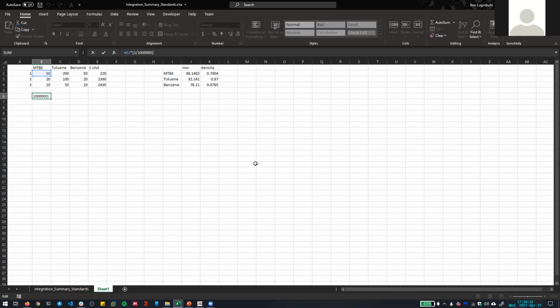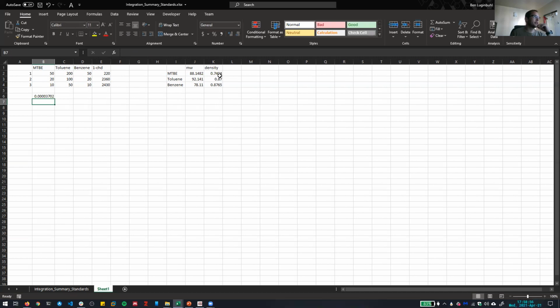Multiply it by the density. You want to get it to grams? Yep, so from that density, remember, that density is in units of grams per cubic centimeter. So we'll multiply by the density real quick. And then what should we multiply that by in order to get it in grams per liter? And actually, we can do an extra pre-step here. These are all in grams per cubic centimeter, right? So let's multiply them over here to get those in grams per liter instead.